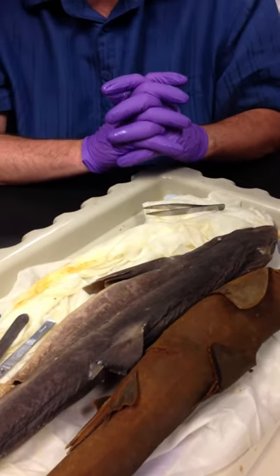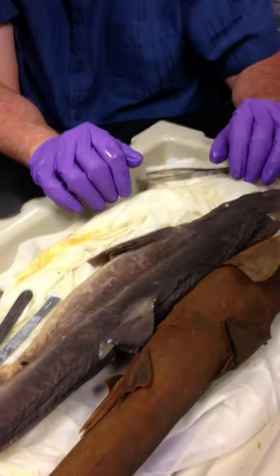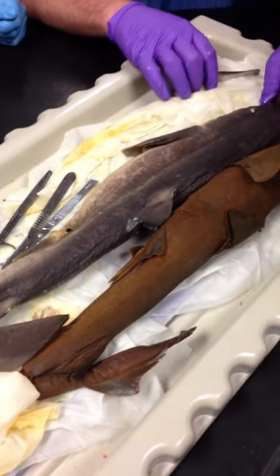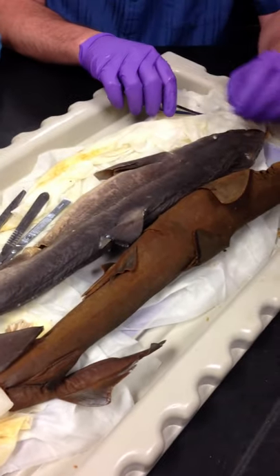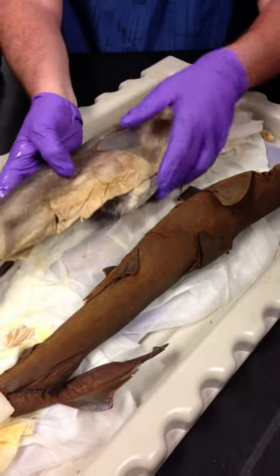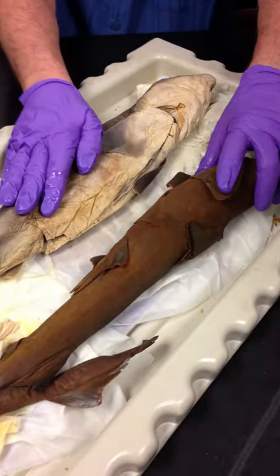Hi, this is Smooth Hound Shark, and this is a camera bomb. Okay. This is Kingdom Animalia, Phylum Chordata, Subphylum Vertebrata, Superclass Gnathostomata, class, I skipped a level somewhere, Chondrichthyes. This is a Smooth Hound Shark, and this is a female one, and this is a male one.